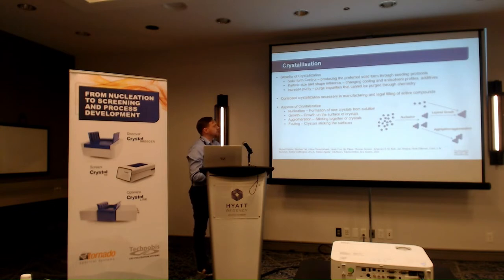So the benefits of crystallization, which are probably well known by most people in the room, start with solid form control. You're able to produce the preferred solid form you want. This can be done through seeding protocols or very strict control of either temperature profiles or anti-solvent profiles. Then particle shape and size influence: by changing cooling rates and anti-solvent profiles, or even using additives, you can control which surfaces are growing and which aren't, or if you want to enhance the nucleation more.